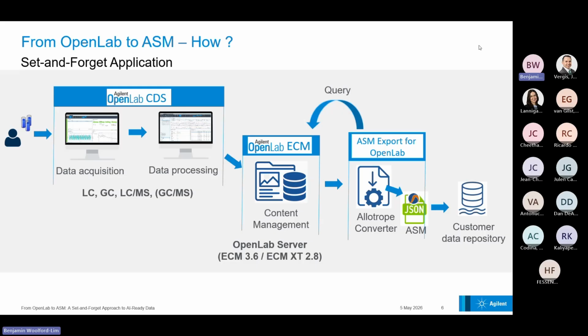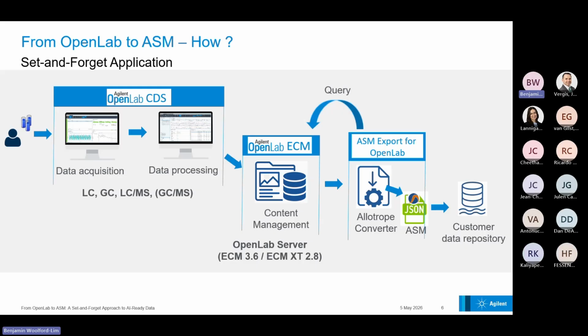So eventually the ASM file gets generated automatically and gets pushed to a customer data repository, which the customer can define remotely herself.